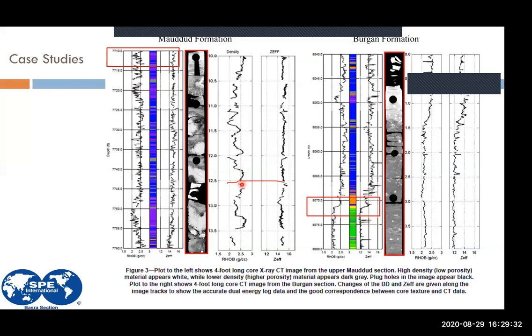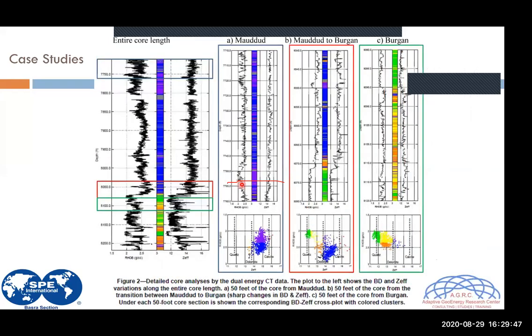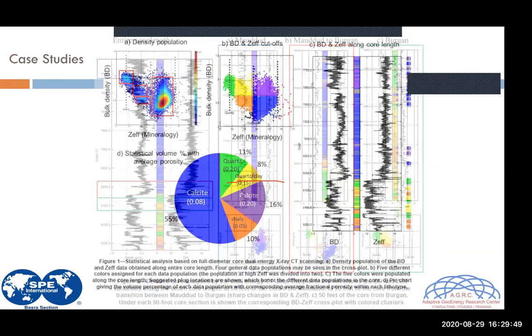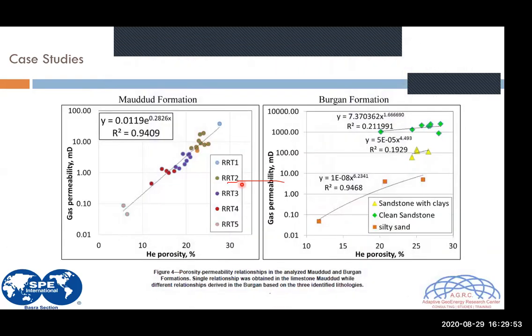And here, just to show you that you can start with this small acquisition here in a whole core scale, and you can put all of the data together to generate the full log here that you see in the first slide. It's an application where the workflow is similar to the previous one that I showed, okay?